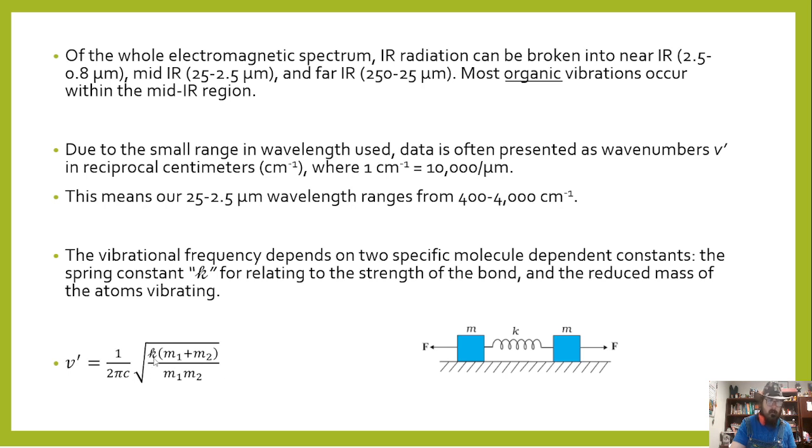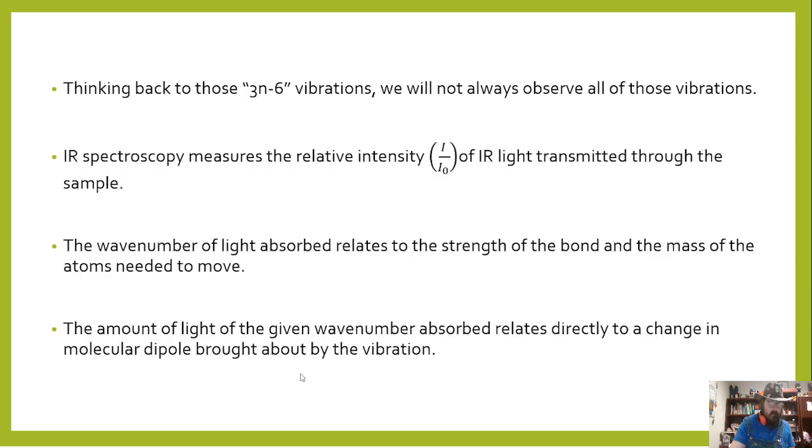Triple bonds occur before double bonds because triple bonds are going to have a stronger spring constant. They're going to occur further on the left than on the right. So, because of this product on the bottom, that's what's going to be pushing it to the right or left, largely. But all that just predicts where the vibrations occur. Not necessarily will we see those vibrations.